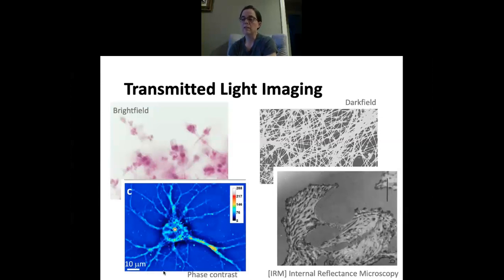It's my opinion that applying transmitted light methods in combination with live cell fluorescent methods is a very powerful way to derive information about specific fluorescently labeled submicron dynamics, for example, GFP gene expression markers, and the morphological subcellular context surrounding those systems, which might be, for example, the formation of synapses or the movement of filopodia.